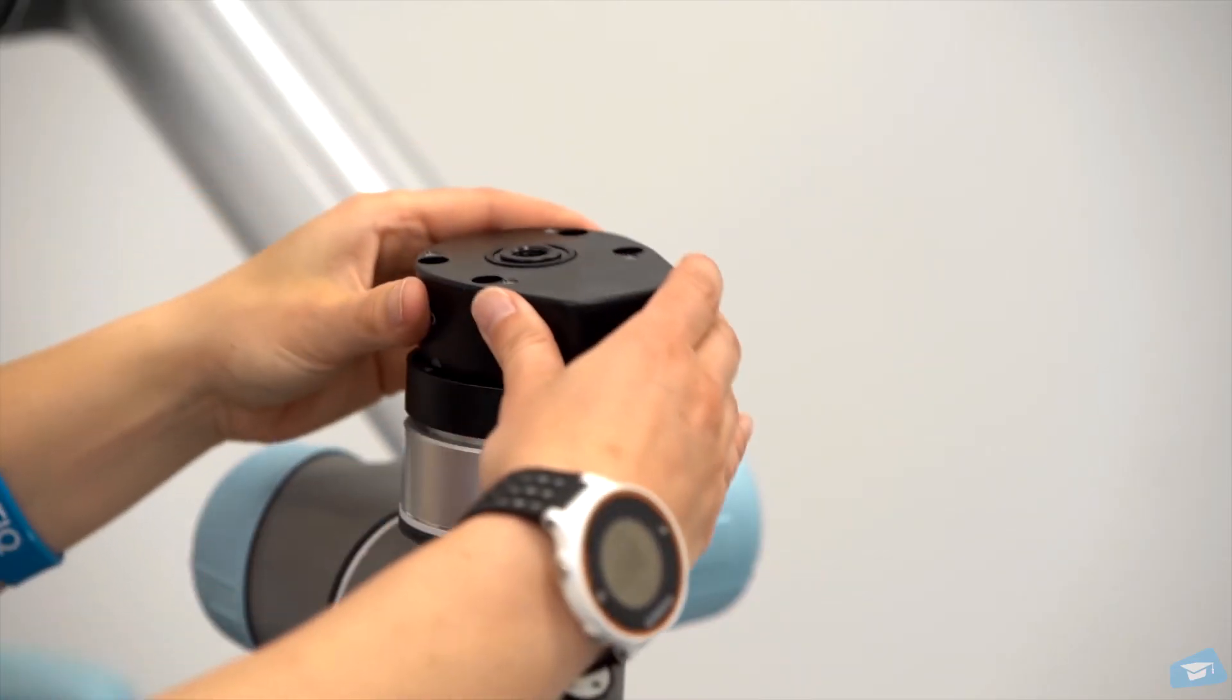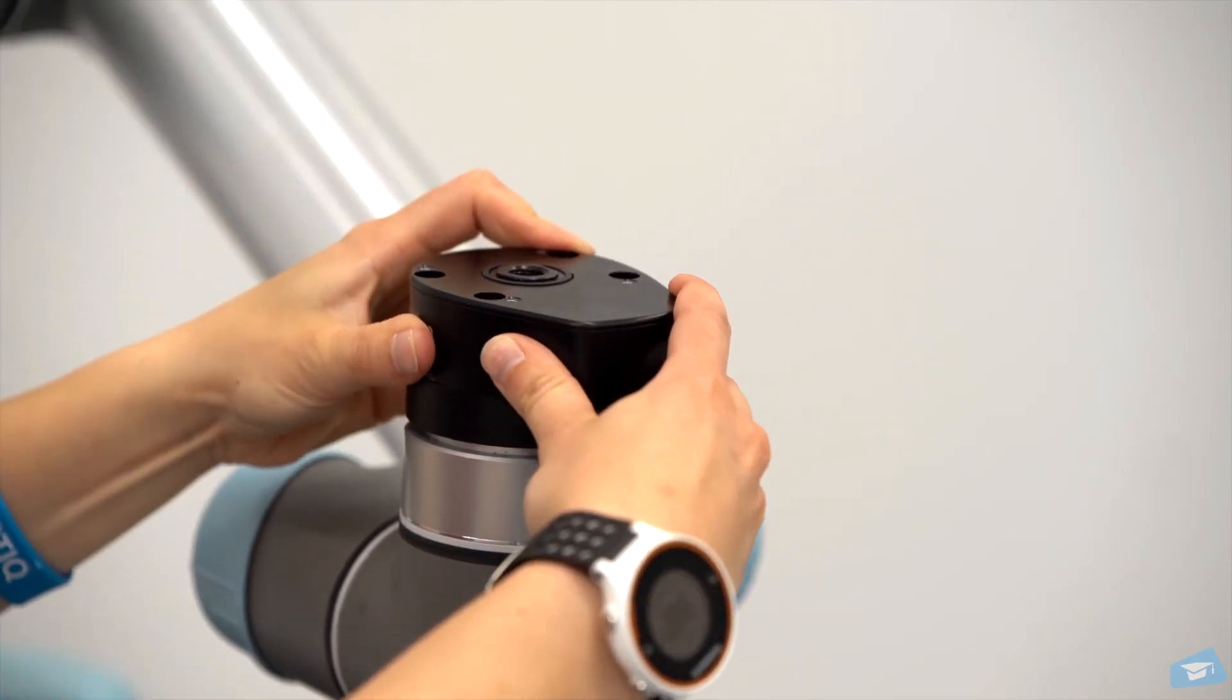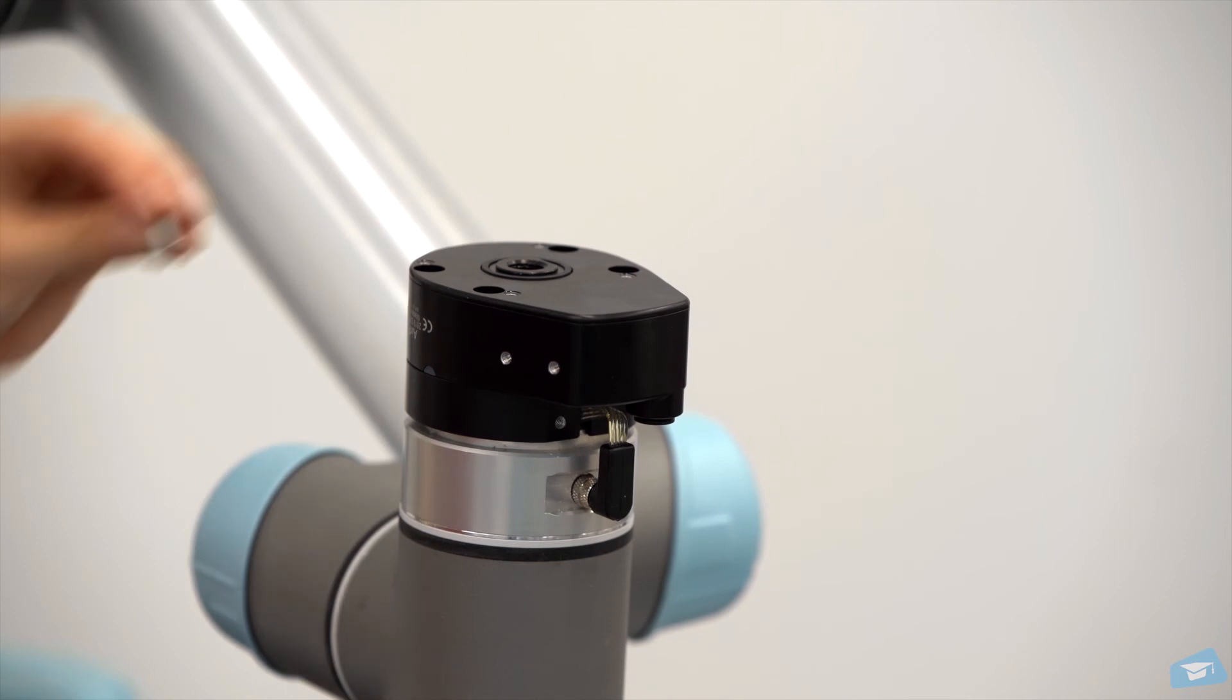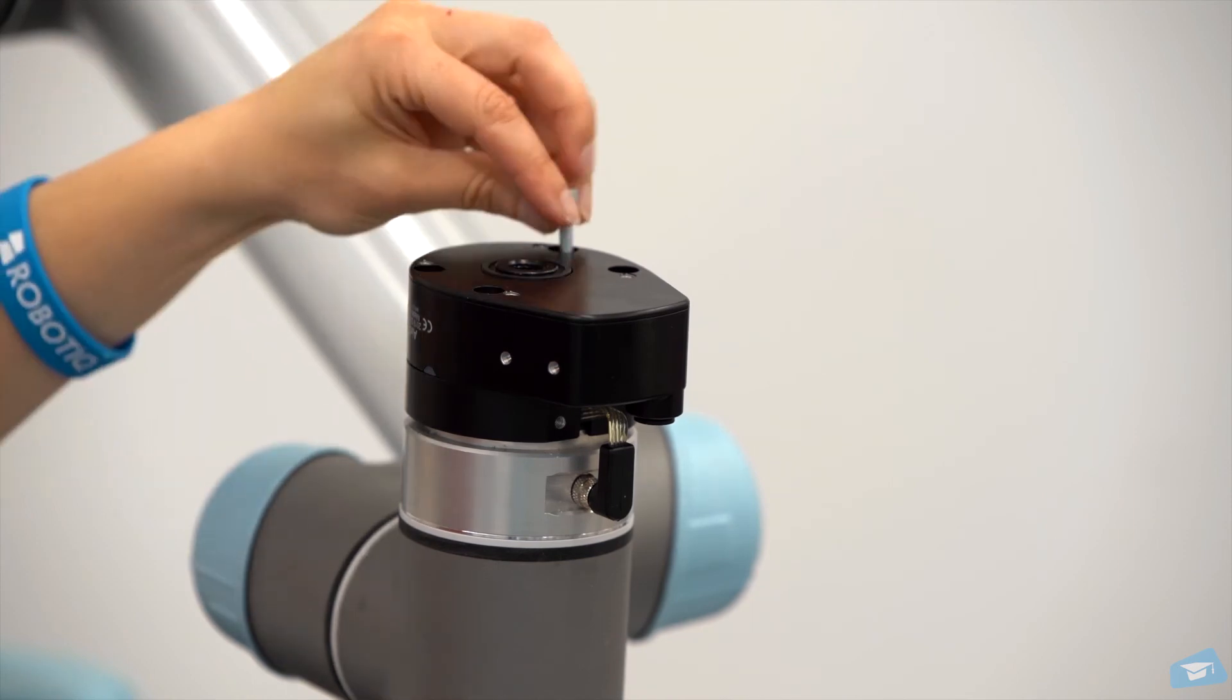Mount the Airpick Vacuum Gripper on the coupling with the provided M5 screws and tooth lock washers.